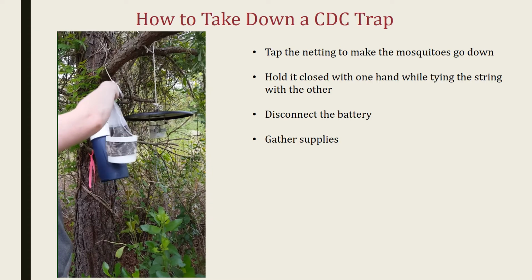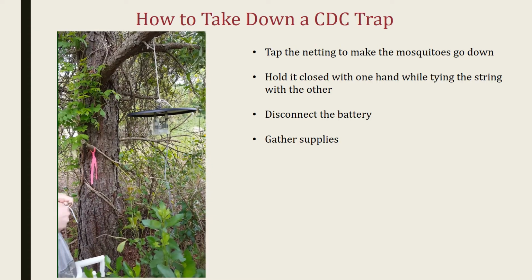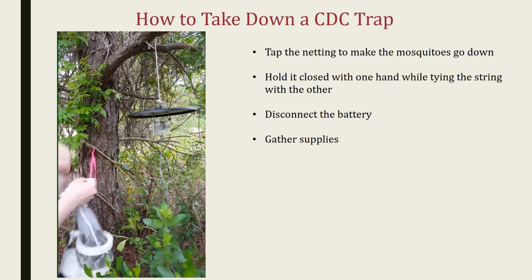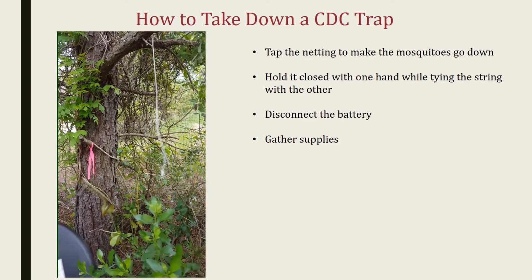gathering your supplies. In this, I'm going to take off the cooler hanging from the tree, and then pull the string that's on the tree off the trap, and then take the trap with me, along with the battery on the ground.